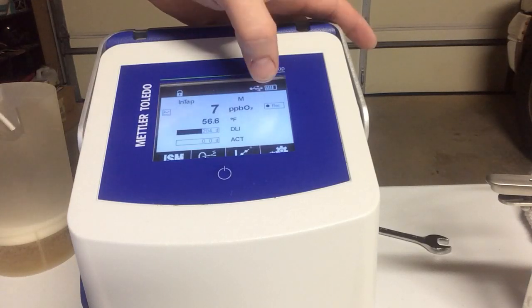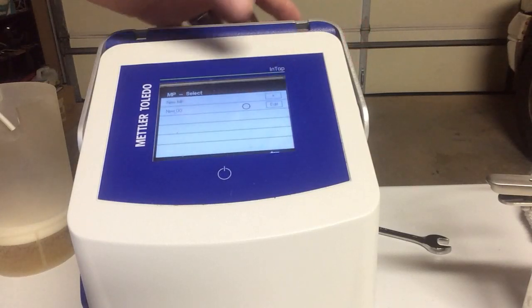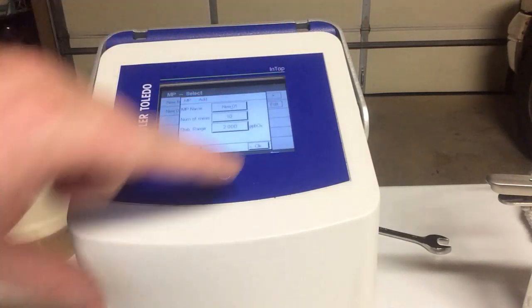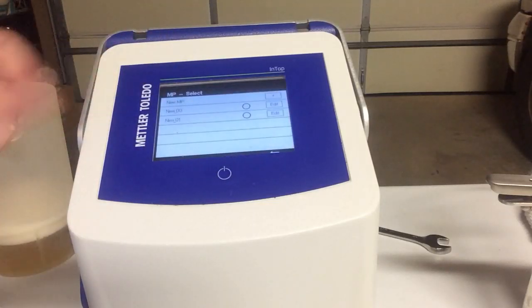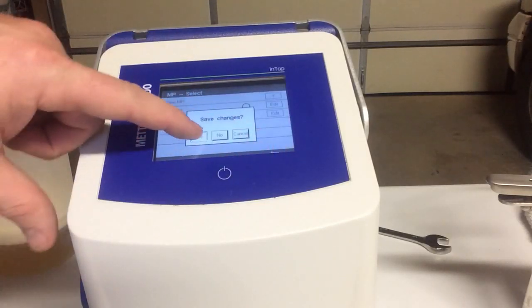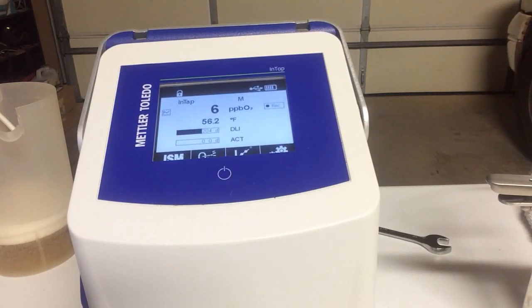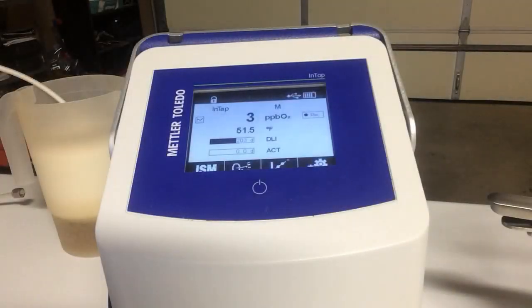With this here, you see a manual record. I can sit here and add this, and we can label it whatever we wanted, but I'm going to just click OK, and now I've got me a measurement that it will take readings for me while I'm doing this. This beer's getting down to 3 ppb. There we go to 2. And again, we're at the end of that beer now.